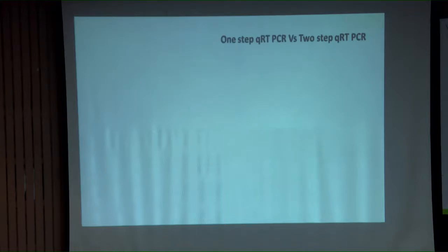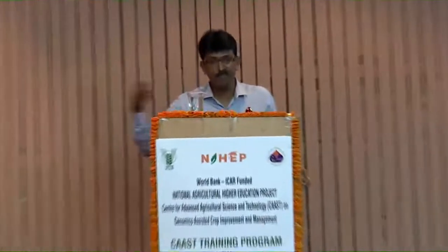So what you do, maybe in your case, you make the plant infested by an insect, then post-infection you take samples at different time points, then you extract RNAs, correct? So when the insect is infesting a host, if the objective of your experiment is to study all the changes taking place in the host, then you need to handle RNA in your experiments, right? So you have isolated RNA.